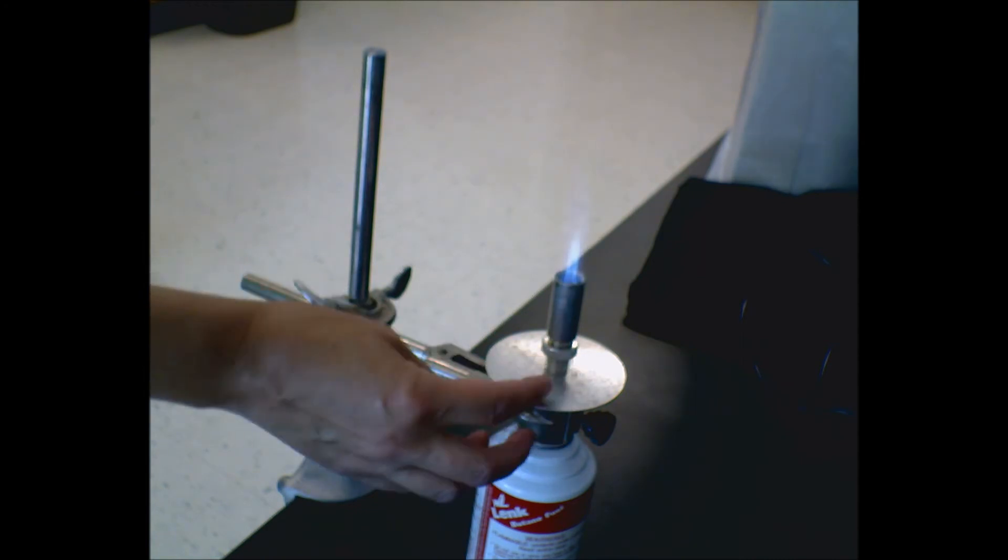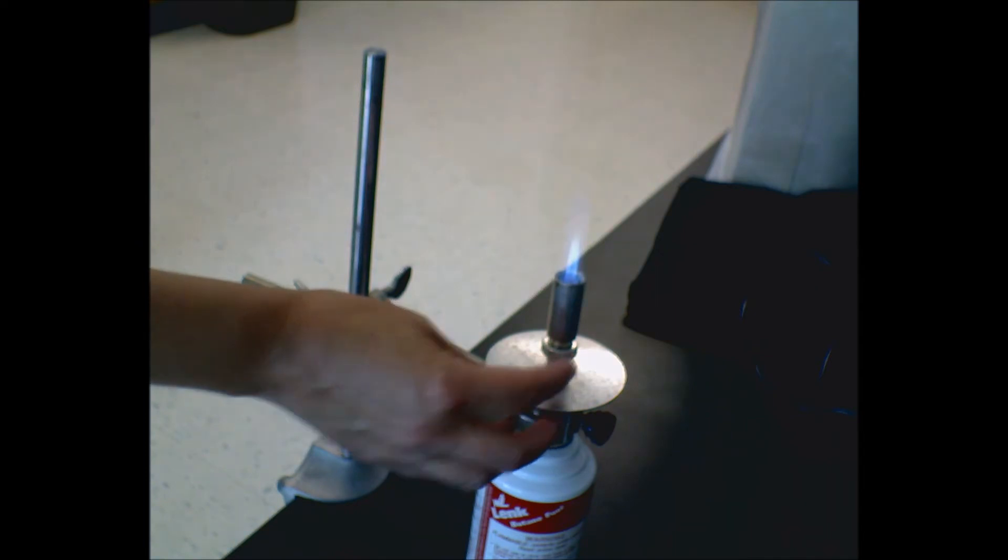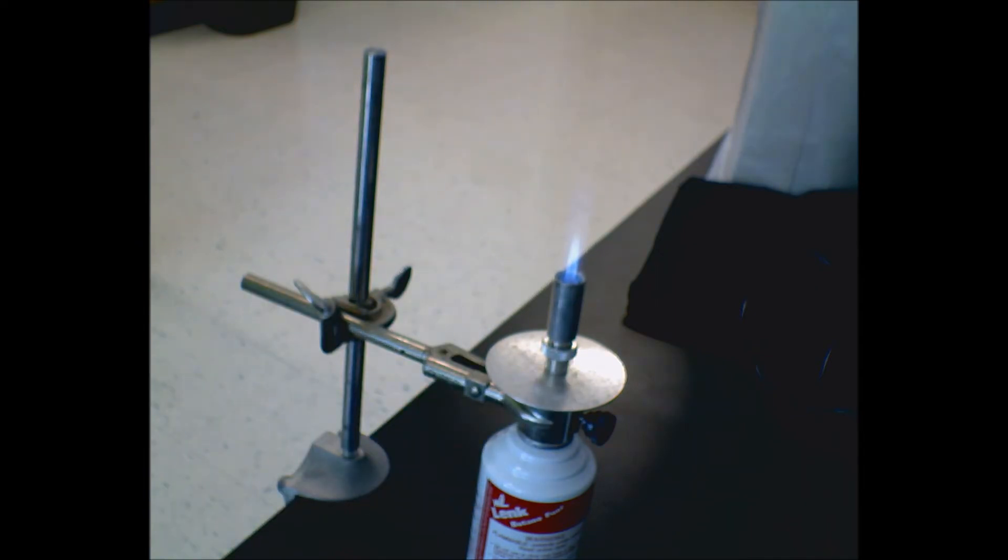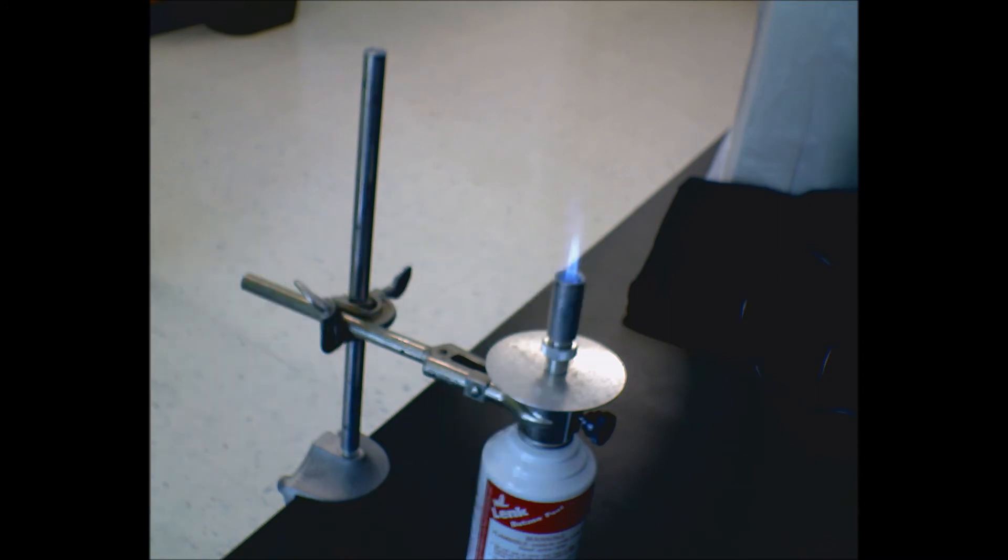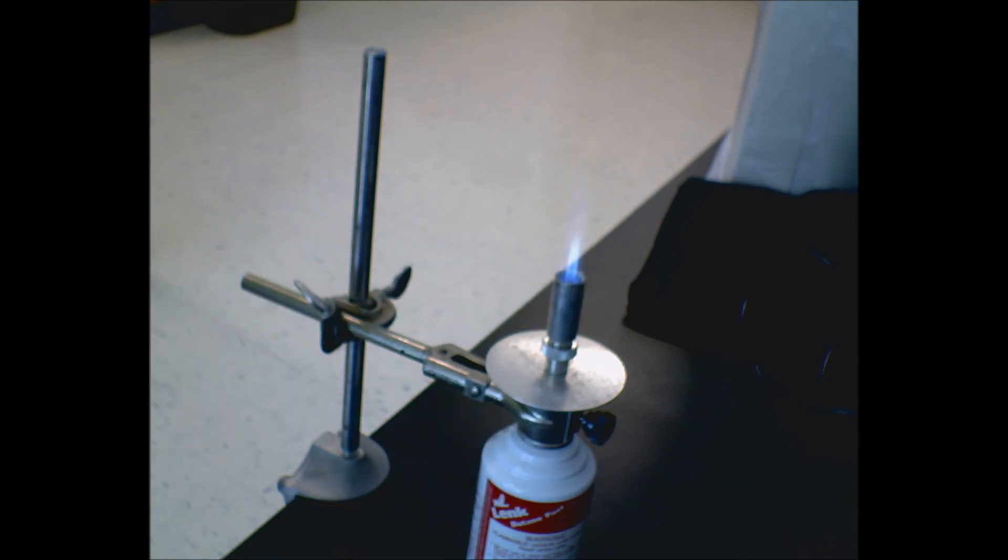This looks more like what you expect when you see a Bunsen burner. If you keep going down, you'll get that little roar. And that part, that cone right there, that's where it's really hot.